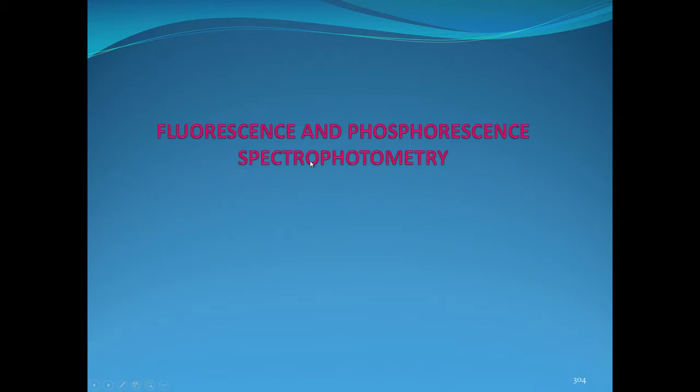Let us continue our discussion on the accessories of spectrophotometer that includes fluorescence and phosphorescence spectrophotometry. Yesterday I gave a small brief introduction to fluorescence and phosphorescence phenomenon.